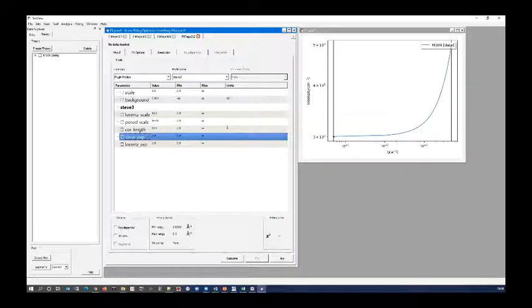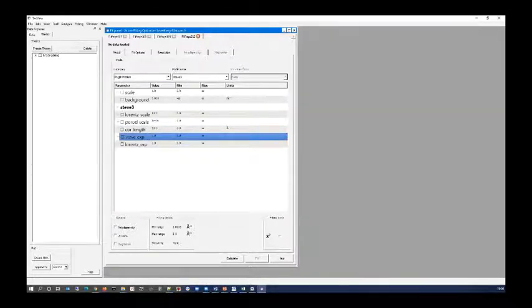So my time is fast running out. What I would like to do to just finish up is to show you some of the other things that you can do in SasView. So here under analyses, you have the various things that SasView can do, okay? And so far I've only shown you fitting. So why don't we start at the top and work down? So the first one is correlation function analysis.